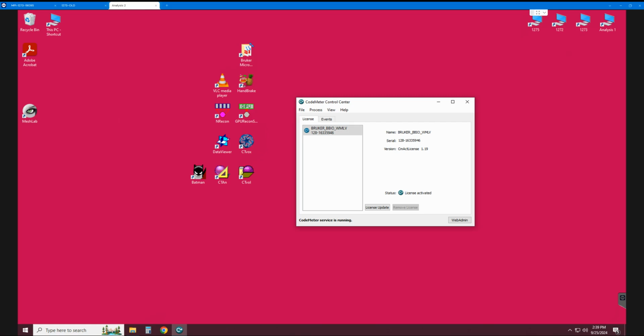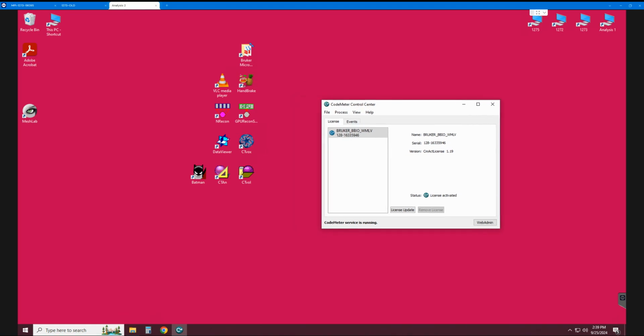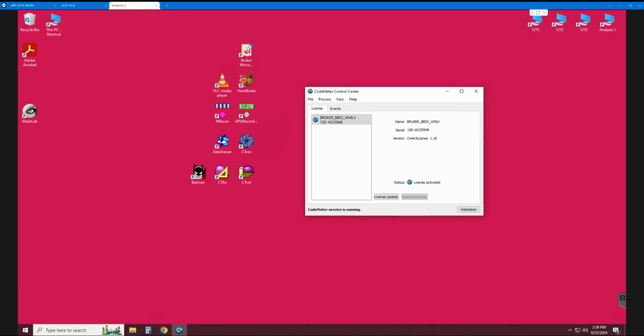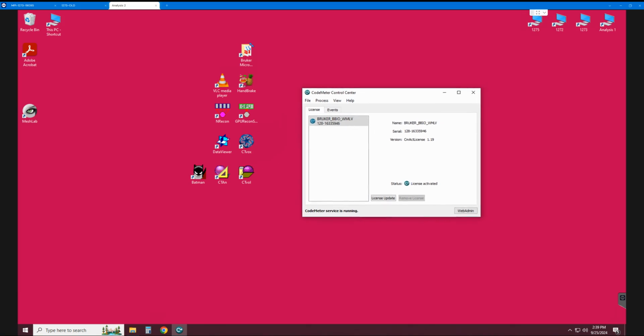While many computers in your laboratory may be running NRecon 2, only the host computer is going to be the one you need to use to do the backup. So if you do not see an active license, it's likely that you're using a sub-licensed computer and not the host computer, and you need to go and find the host computer. In most cases, this will be the computer that was originally provided with your SkyScan instrument.